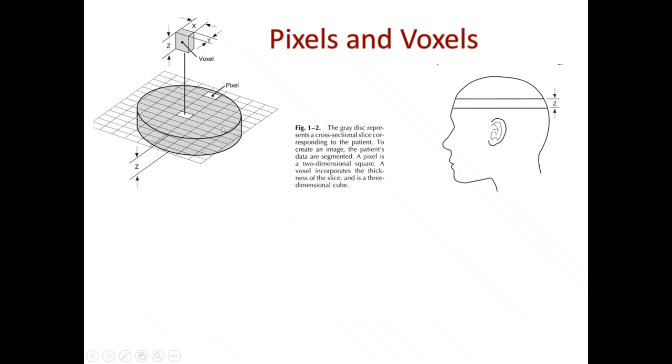Now, we have to understand that these pixels and voxels have a finite volume. I'm averaging over that volume. So there are, of course, errors in that. In imaging the human body, I will have a thickness in these. In CT, we have seen you can choose in the Z direction how big a spacing you're going to use. But technically, when you get an image here, you're averaging over a certain thickness close to that. And in between, you don't have values. And if you need to fill them in somehow, well, you fill them in somehow.